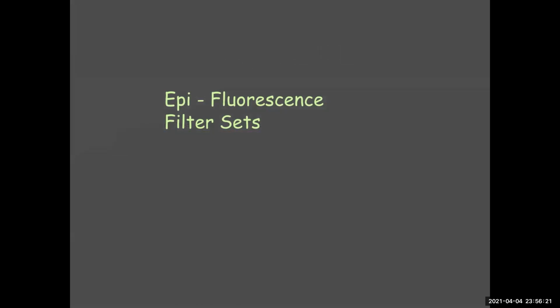So let's look at some fluorescence filter sets, or its fancier full name, epifluorescence filter sets. Again, people just use whatever they feel like using.